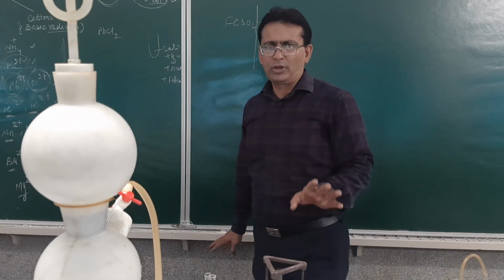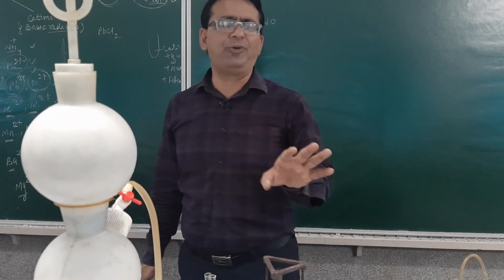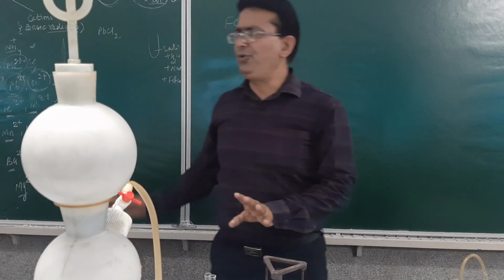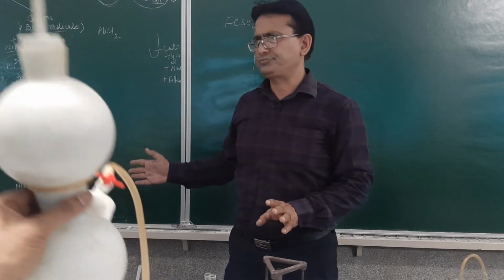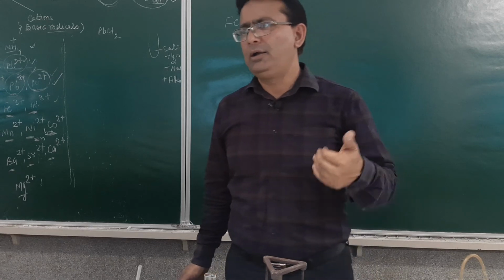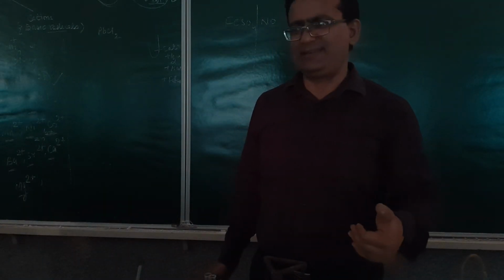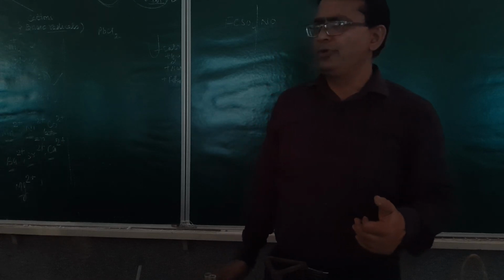Now students, today you have been given the salt just to have a first hand experience of how to carry out the procedure. Even if you obtain or correctly identify nitrate and the lead salt, I will suggest you go through the process so that you get comfortable whenever you come next to the lab. Am I clear? With this, I hope you will be doing your work properly, so you may start your work.